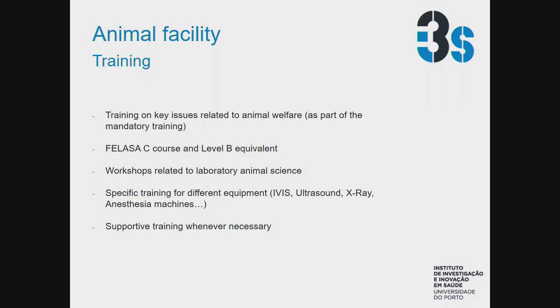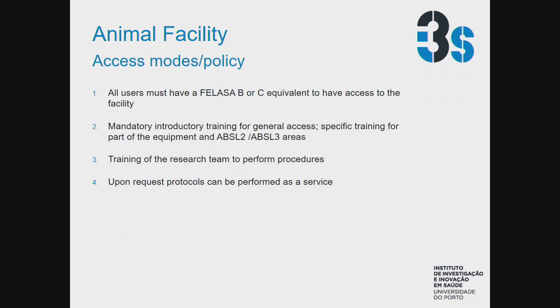Part of this training is related to the mandatory training that we require researchers to do before they have access to the facility. We participate in the organization of both the FELASA C and B courses that are run internally here at the i3S. We organize workshops throughout the year about perfusion, surgical procedures, suture techniques, and other themes related to laboratory animal science. All the equipment that I told you before is also associated with the training program. And whenever a new model needs to be implemented, we will support the research team to implement the model.